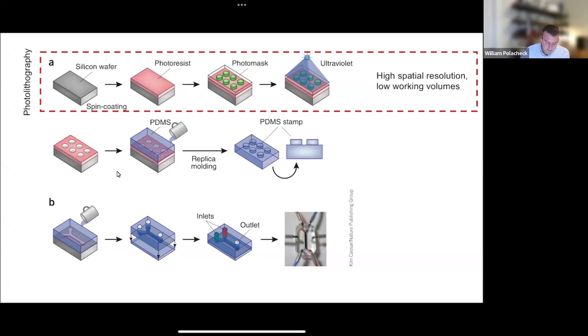And the first step involves coating with a photoresist. So this would be like that bitumen of Judea material that was discovered in the 1800s. We now use polymers such as the SU8 class of polymers. These are materials that are specifically designed so that if they are exposed to light, they become either insoluble or more soluble in a solvent, depending on your workflow. The typical photoresists we use are what are called negative photoresists, and these become insoluble when exposed to light.